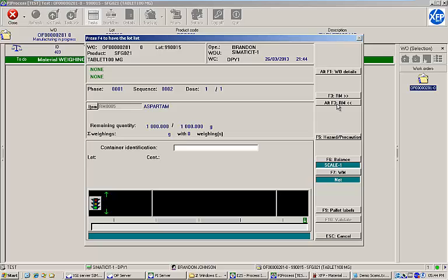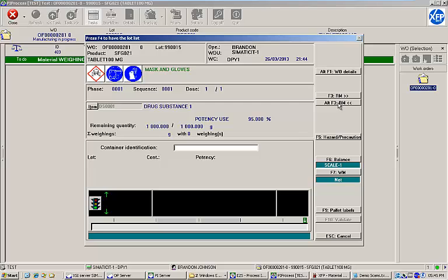Below that, any relevant hazard and precautionary pictograms for the material to be weighed are displayed. Relevant storage and handling instructions are displayed as well. In this case, the operator is warned that a mask and gloves are required for handling of the material. The phase, sequence, and dose numbers from the bill of materials are visible here as well.